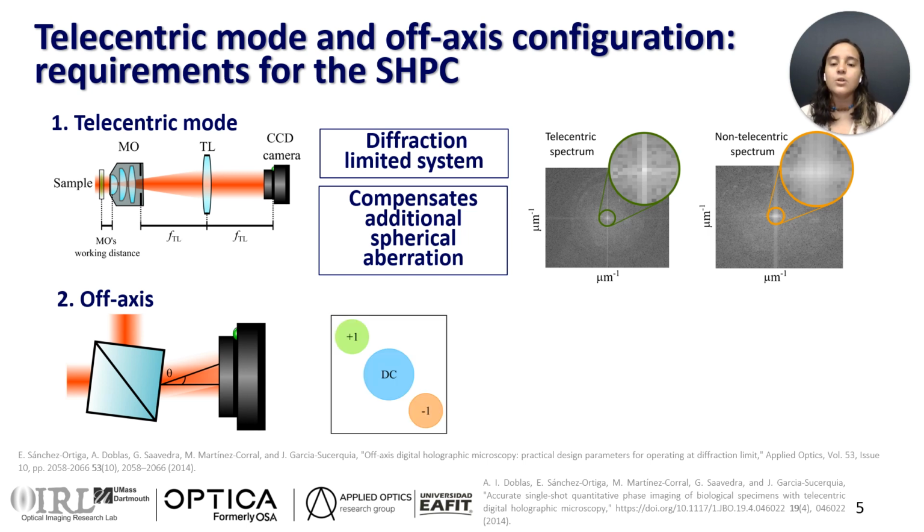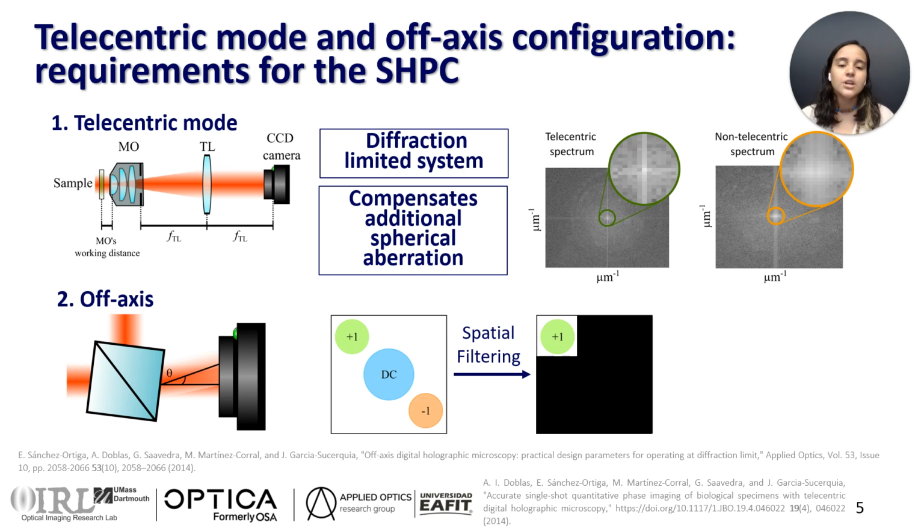This is the equation that models the digital reference that we create for each hologram. As you can see, this, among others, depends on the tilting angles between the interfering wavefronts, which also depend on those carrier frequencies that I just mentioned. So how do we find them without needing to know the physical angle? We can estimate it.